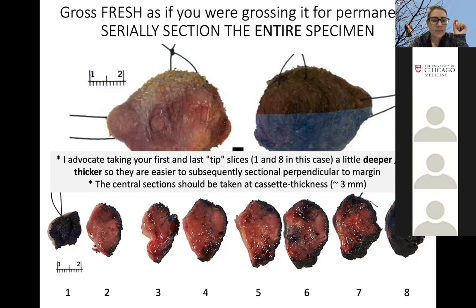That'll be on the next slide. So regarding those tips, I've talked to some of you about taking your first and your last tip slices, in this case 1 and 8, a little bit thicker, mostly because you're going to end up perpendicularly sectioning them, right?